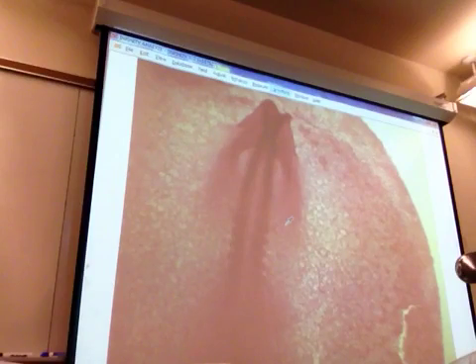Well, in the 12-hour one where it looks like there's just a fold, is that the primitive streak or is that the neural groove? So that's the neural groove by that time. Because remember, gastrulation occurs around hour 16, I think. Let me look real quick. Well, if it's hour 16, then it probably. 20 to 22. Oh, wait. Oh, you changed it to a different hour, didn't you? Well, remember too, this is chicken, not human. So that's different too. Yeah, I know. I'm saying I've looked at a 12-hour embryo and I thought I saw a primitive streak. Now I'm wondering what it was.